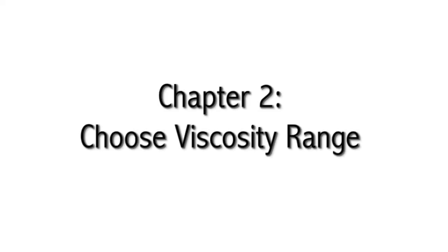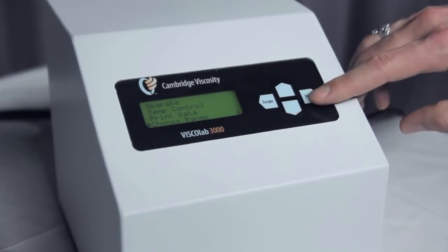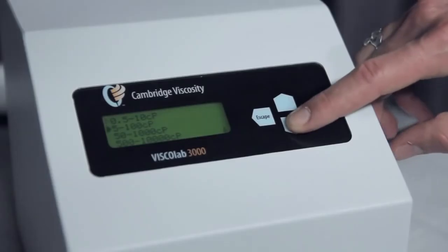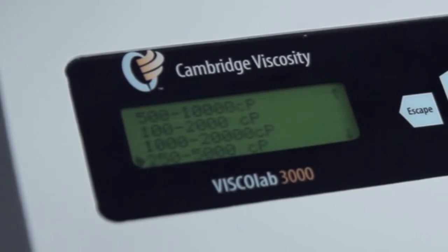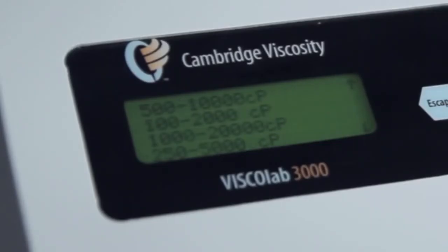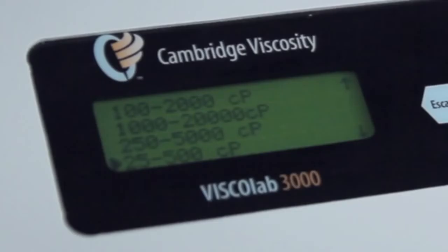Chapter 2: Choose a Viscosity Range. From the main menu, push the down arrow three times. Press enter on 'Choose Range.' Use the up and down arrows to select the desired viscosity range that correlates to your piston range. Press enter once the desired range is chosen. Note: for this video, we are using a viscosity range of 25 to 500 centipoise.